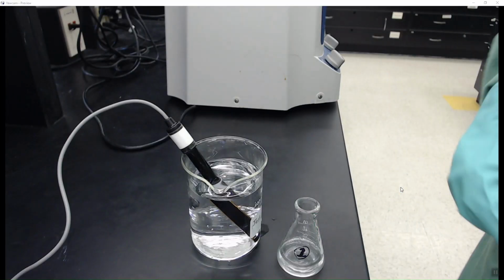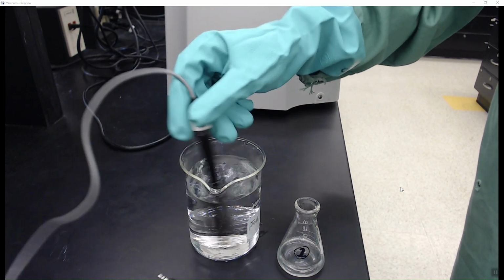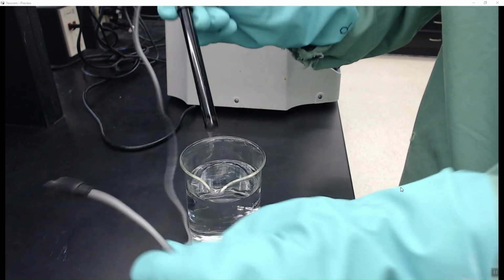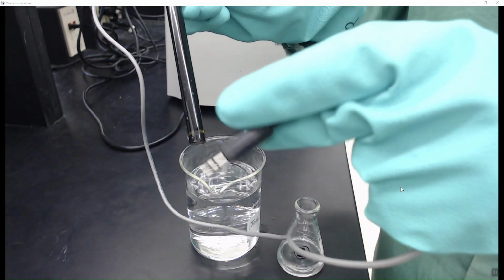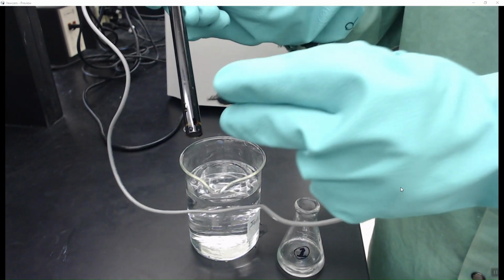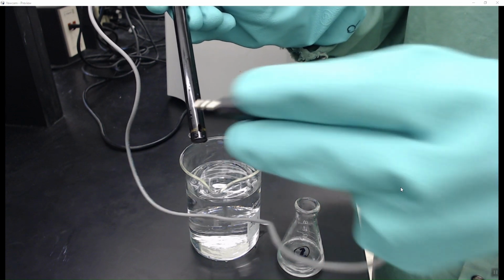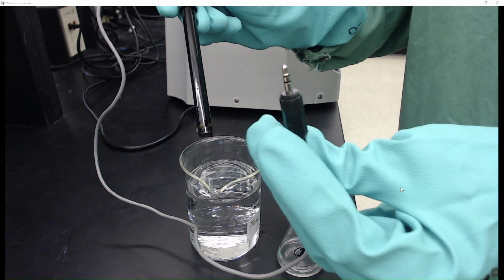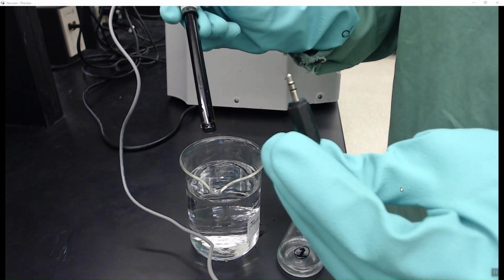All right, so here we are in the lab, and what I have here is a large beaker of water. We're going to use this to rinse our conductivity probe. This is a conductivity probe right here, and I don't know if you can really see it, but there's a hole where the solution gets in and it analyzes it, so you need to make sure your solution is above that. It also has an old headphone jack, so make sure that you have the right conductivity probe. You don't have a thermistor, which has an Ethernet cable jack.